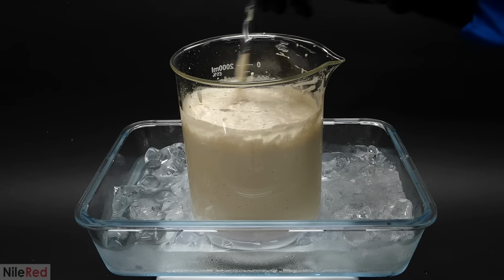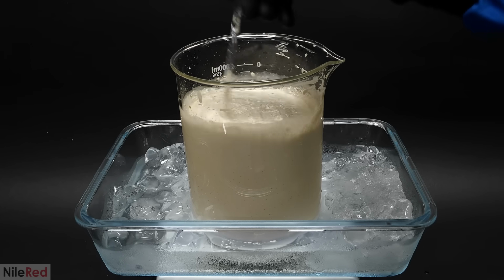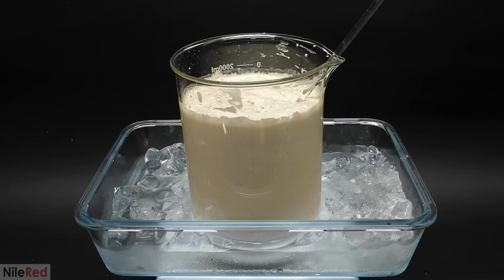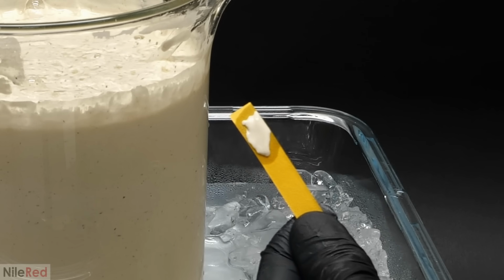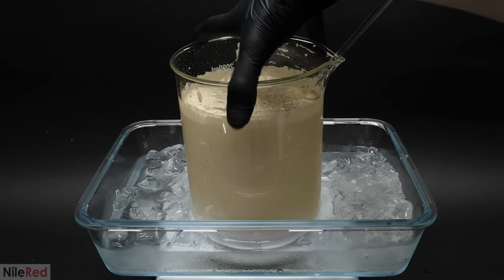At some point, it really started looking way too much like iced coffee, and it was a bit scary how much I wanted to taste it. That would have been a horrible idea, though, and it would have tasted absolutely awful. But anyway, I was eventually done adding the chalk, and when I tested the pH, it told me that it was roughly neutral. What I had now was hopefully a mixture of calcium sulfate and dirty sugar water, and the next step was to filter it.